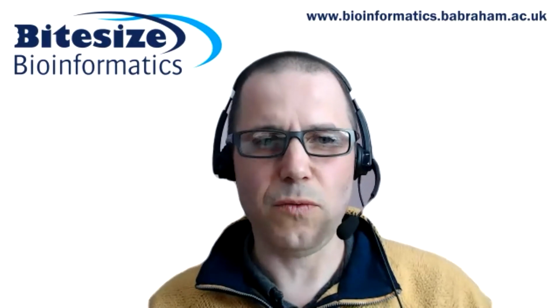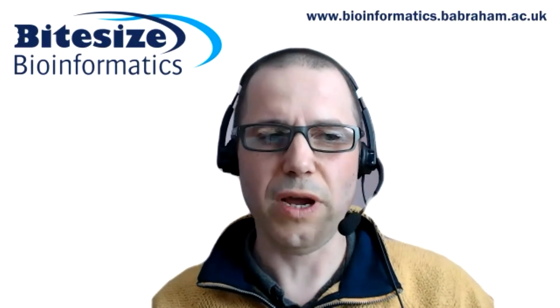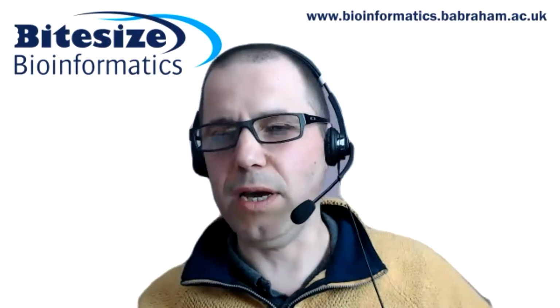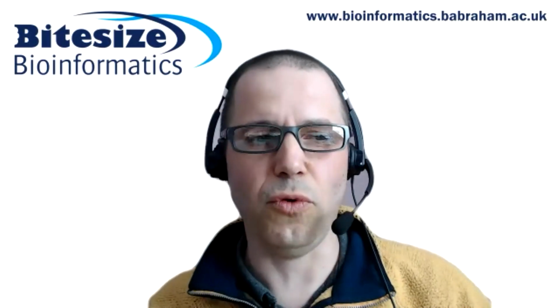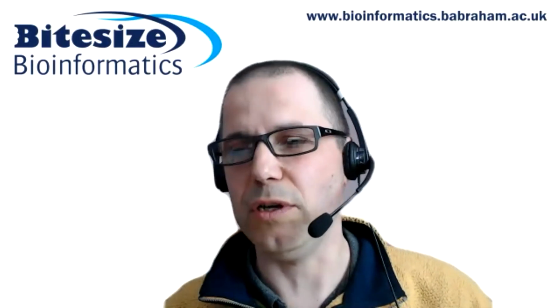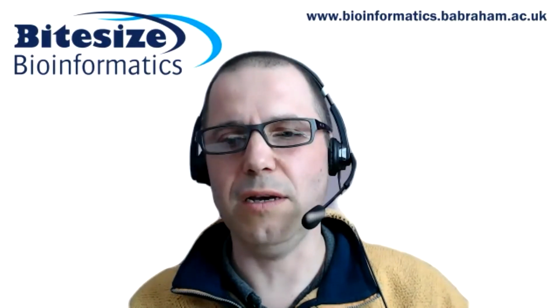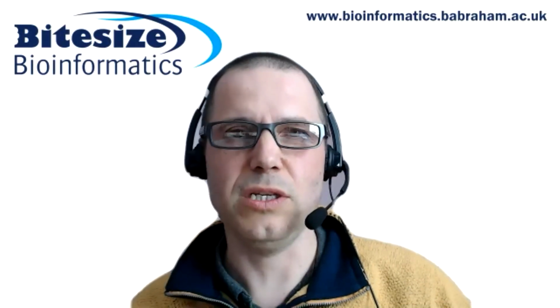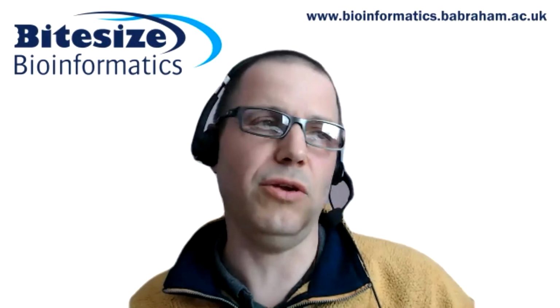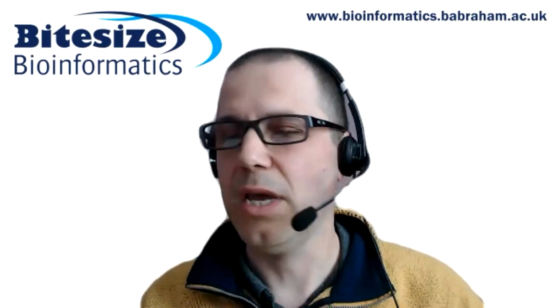To kick off today, we're going to look at something inside the SeqMonk software. Hopefully you're all basically familiar with SeqMonk. It's a desktop application for analyzing a variety of different high throughput sequencing data types. Really anything that produces mapped sequence, so positions in a genome, is suitable for putting into this, and you can analyze RNA-seq, ChIP-seq, ATAC-seq, all of those kinds of data inside it.